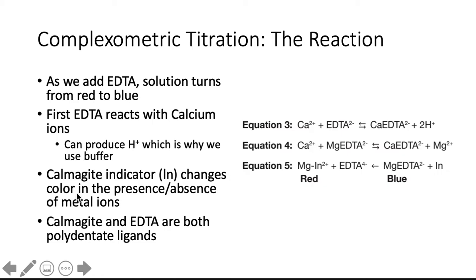So you'll be able to see this clear color change as soon as you have added enough EDTA to completely react with all of the calcium and magnesium that is in the solution. And of course, calcium and magnesium are the things that cause water hardness.